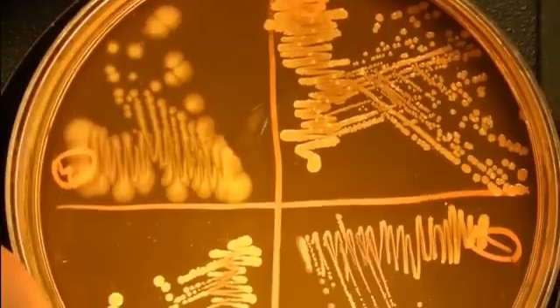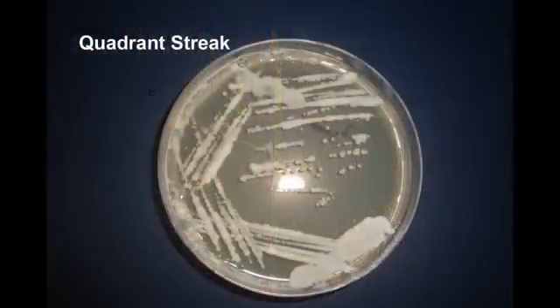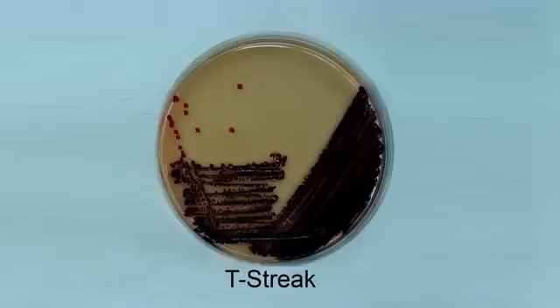The pattern of streaking varies with different types of streak plate techniques. For example, quadrant streak, T-streak, etc.